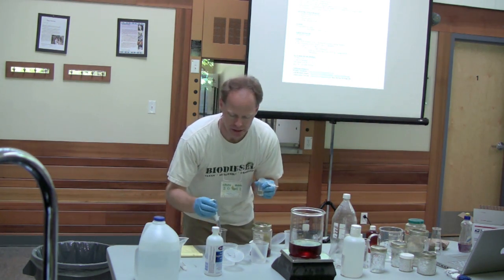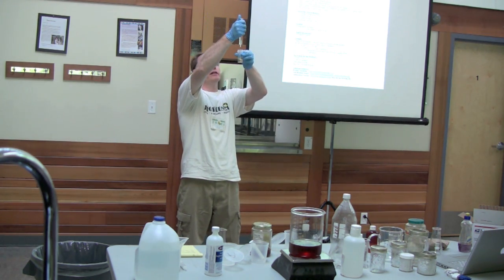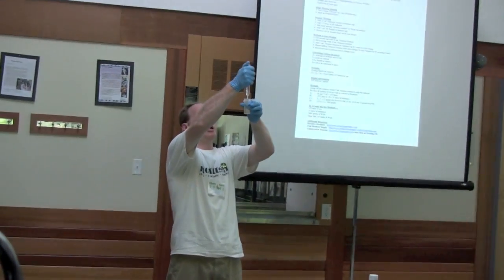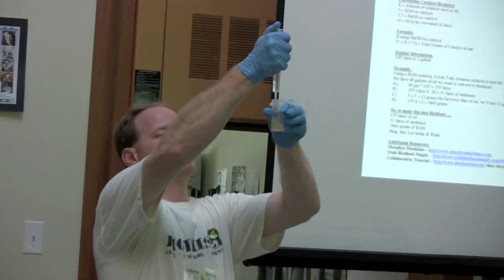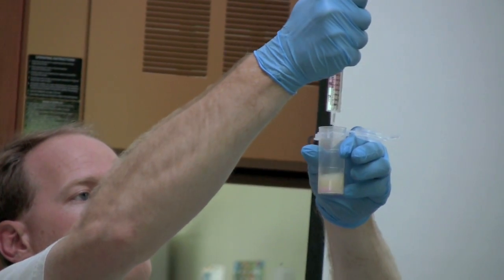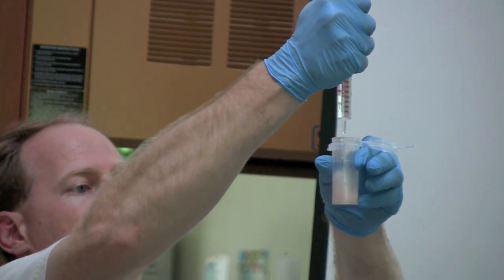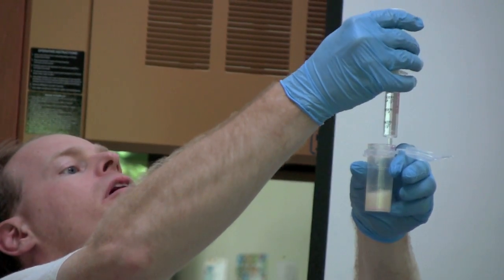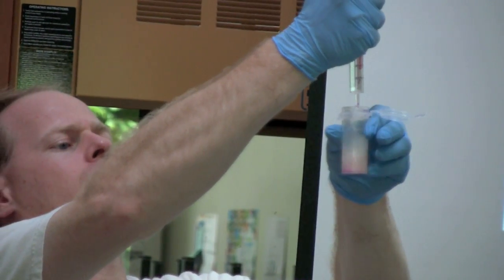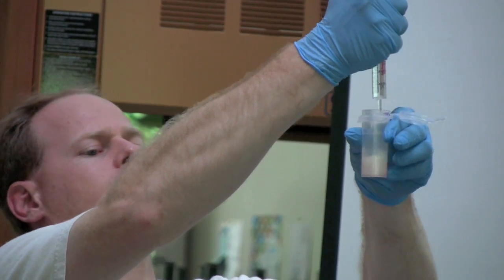Okay. To titrate, you simply start adding measured drops of this stuff into this oil, and we see how many milliliters of this stuff it takes to turn this stuff pink. And this is already starting to turn pink a little bit. There it's coming. See it turning? Oh, this might not be too good. Come on. Wow. Where'd this oil come from?